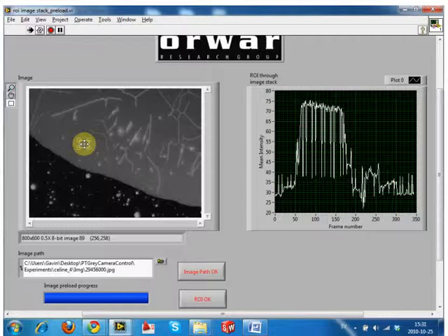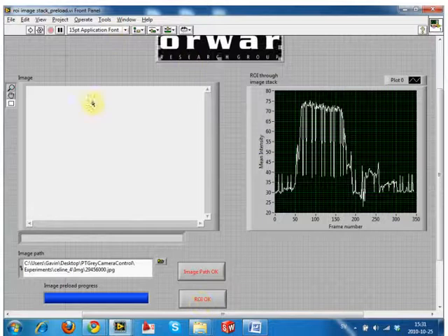And then once you're done, you hit this and basically it just finishes the file. But again, this screen goes white or grey or whichever color it is, which essentially says I cleaned up all of my data when I finished. I don't have any images still in the memory.